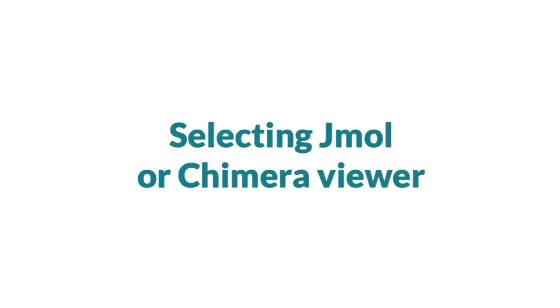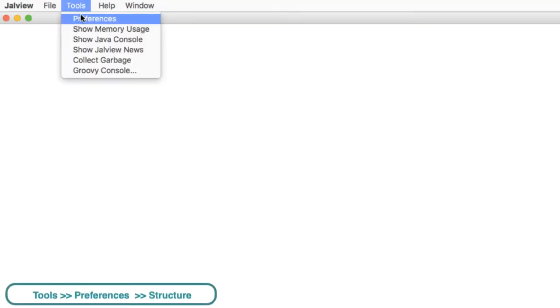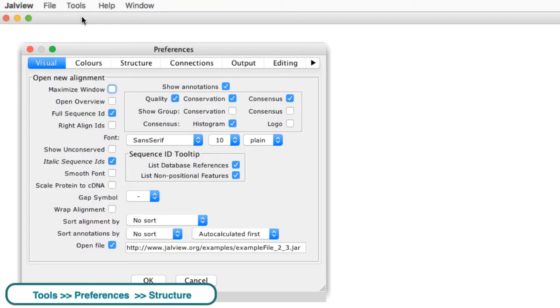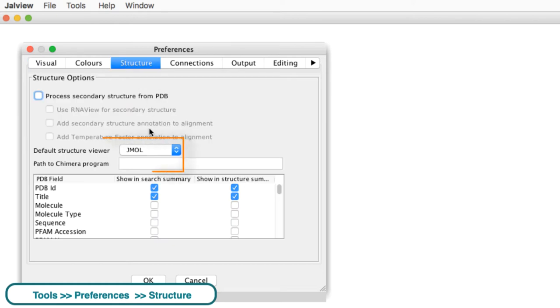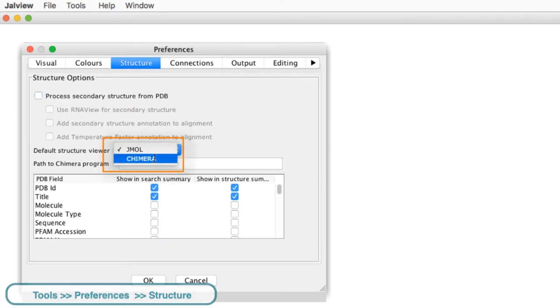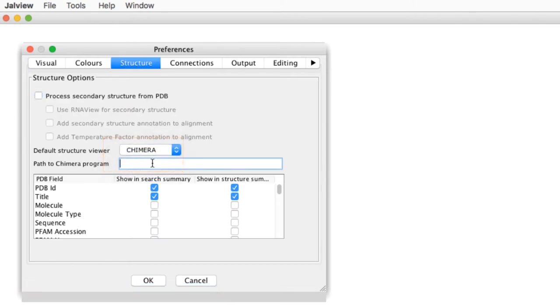To select either Jmol or Chimera viewer, go to the Tools menu and select the Preferences submenu. Go to the Structure page and select the viewer you require. You may need to specify the location of the program but often this isn't necessary.